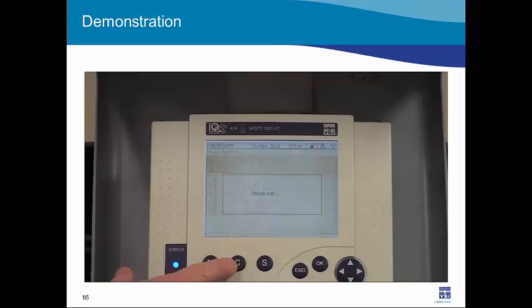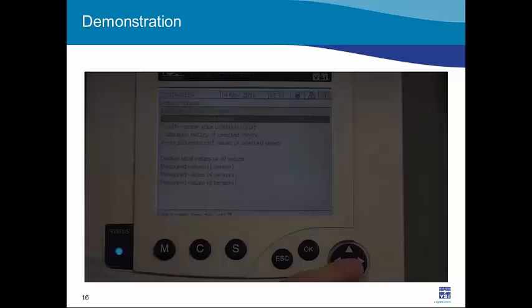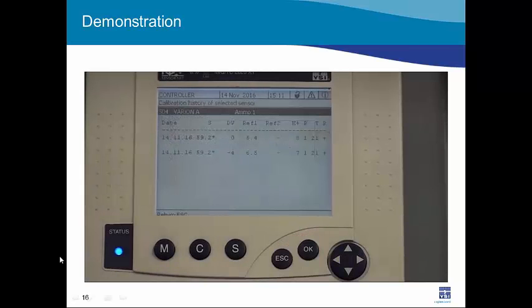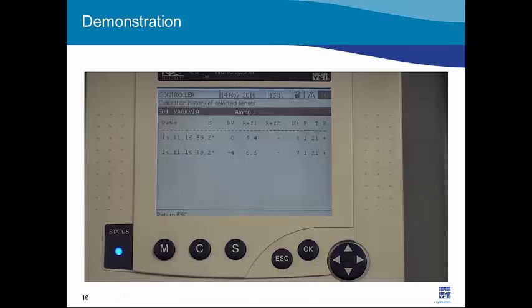One last thing I want to demonstrate here is this calibration history report. And this is all very important information. The line item at the top shows the date and time of when the electrode was zeroed. So you can see that dV, which is drift voltage, is 0. Reference is the laboratory reference concentration that was entered. You've got the potassium concentration, the procedure, which is 1 for matrix adjustment, the temperature, and R is plus, which means it was successful; a question mark would mean unsuccessful.